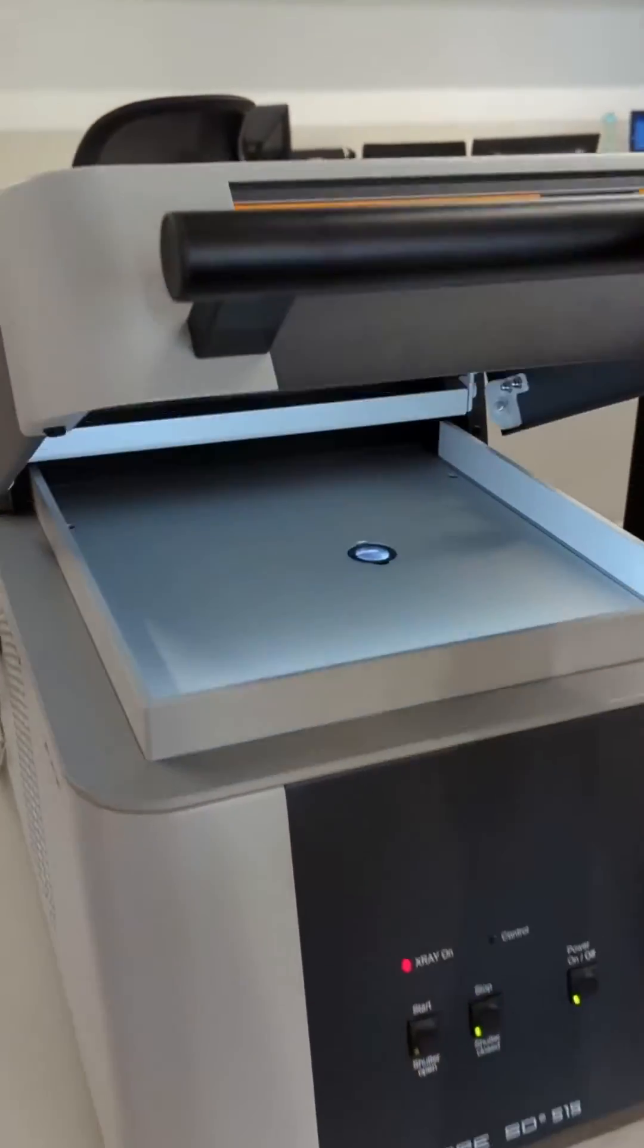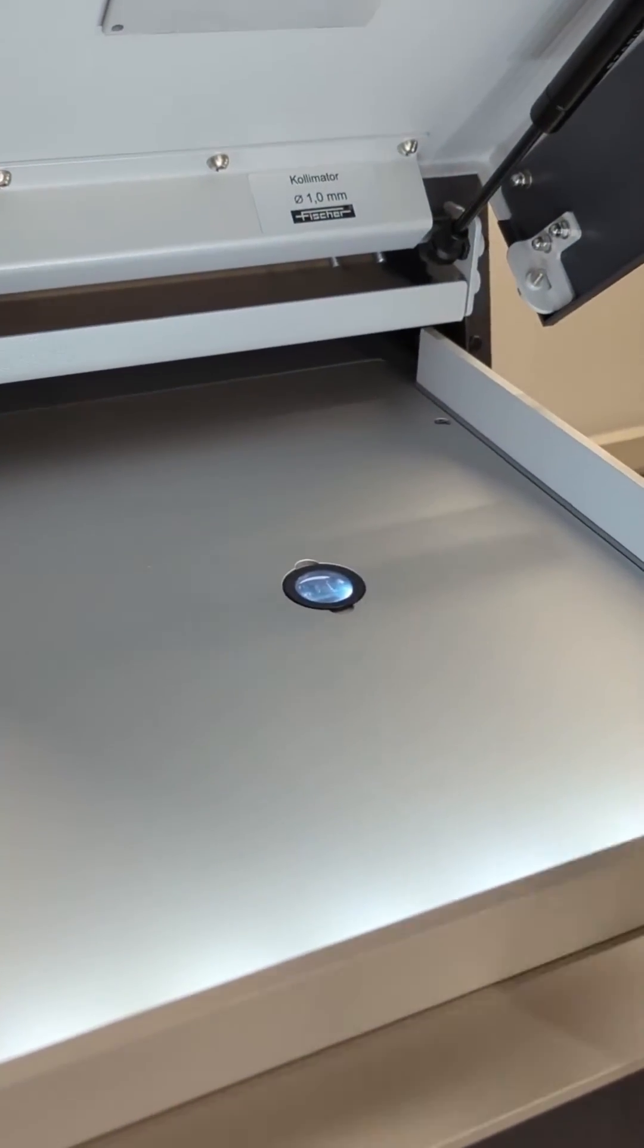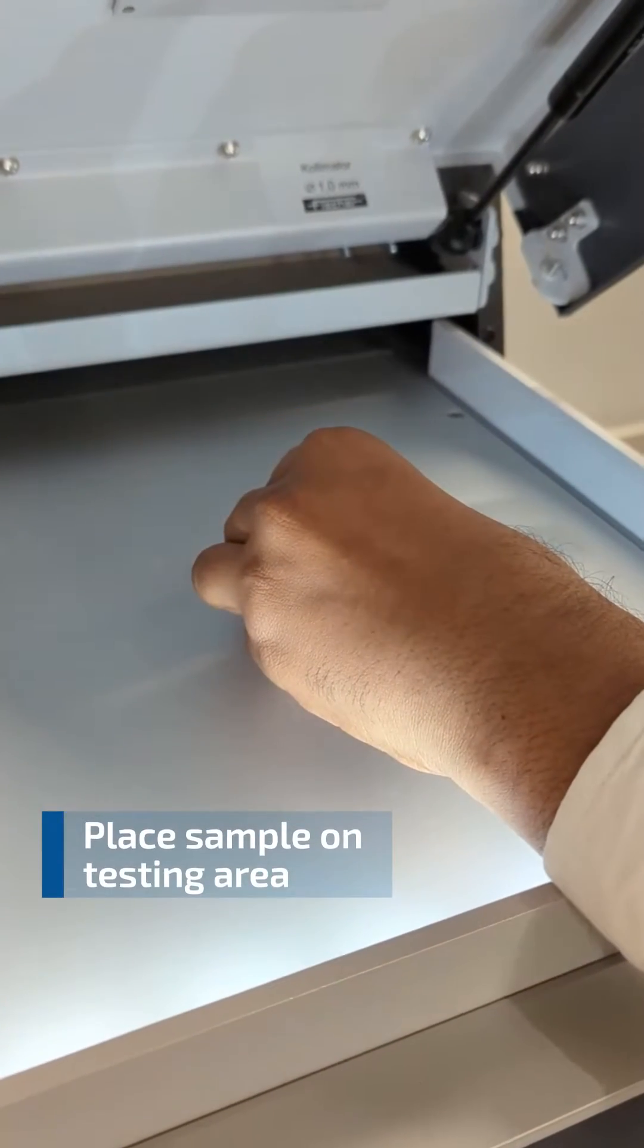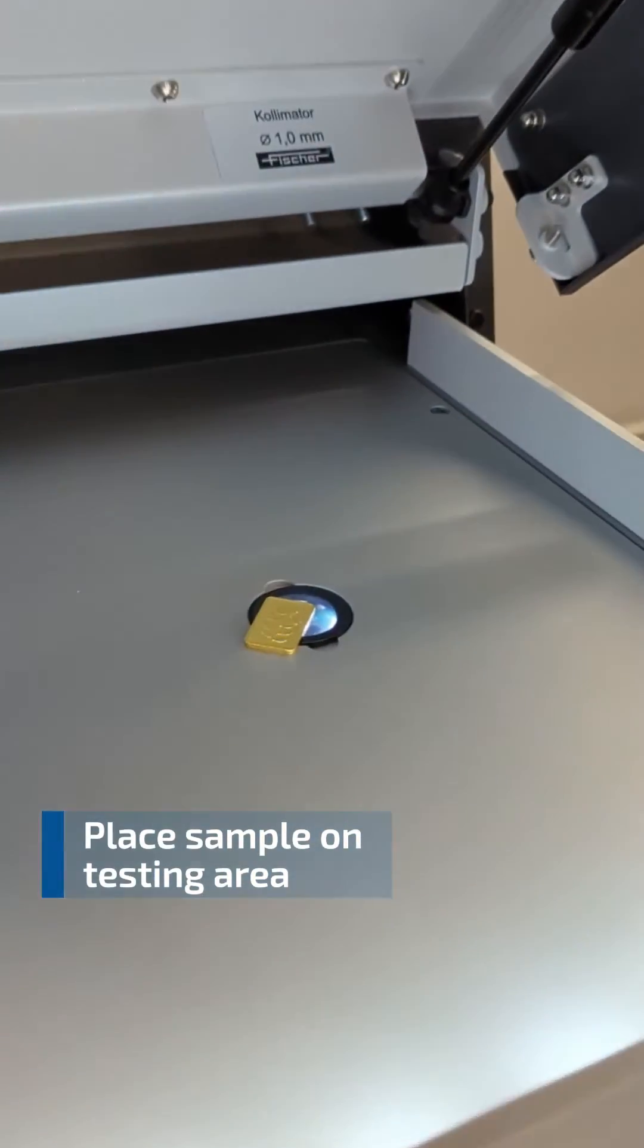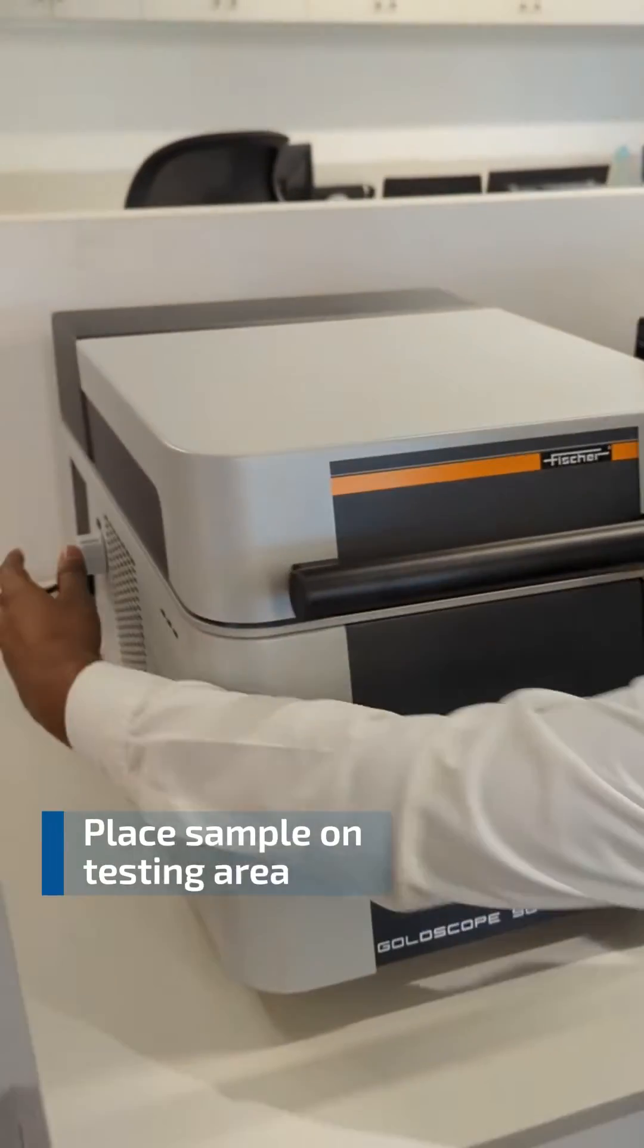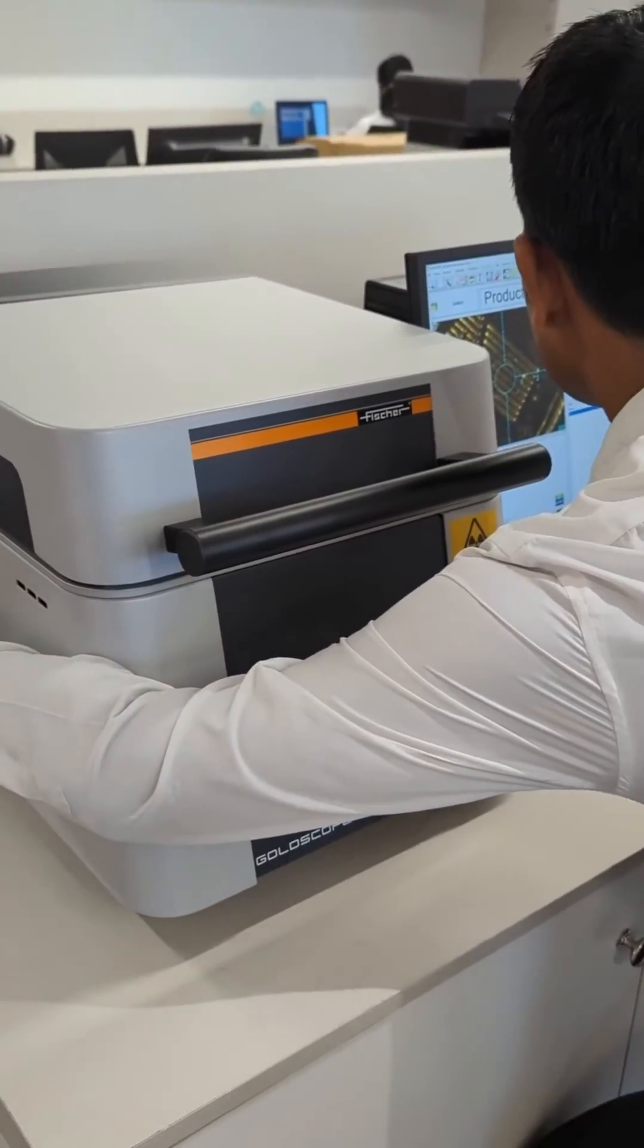These machines have a spacious measurement chamber that can accommodate various sample sizes and shapes. It also has a compact and robust design that ensures long-term use and durability. You don't need any sample preparation to use the Fisher Gold Scope.